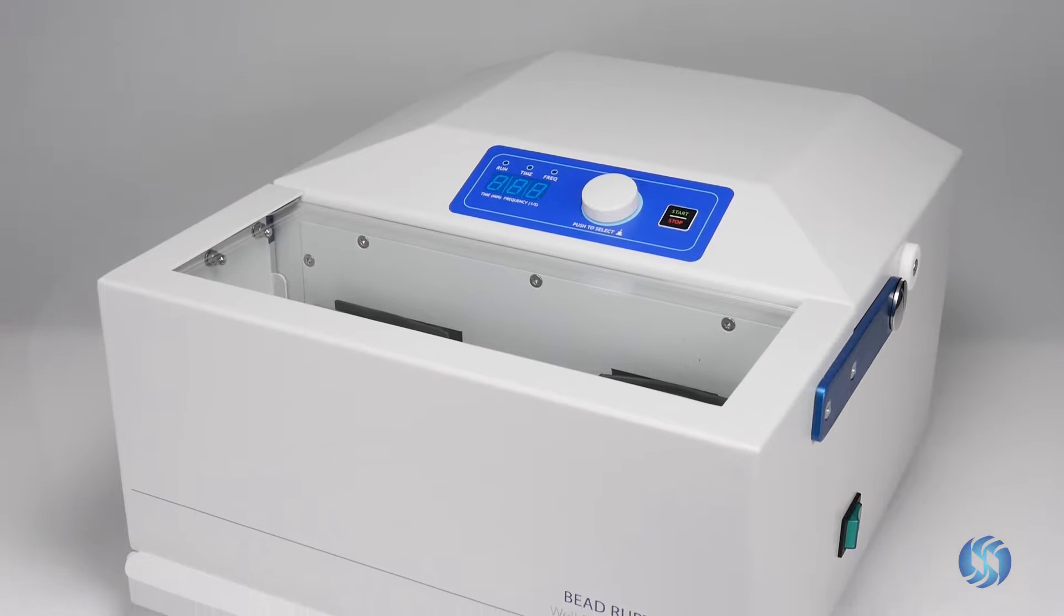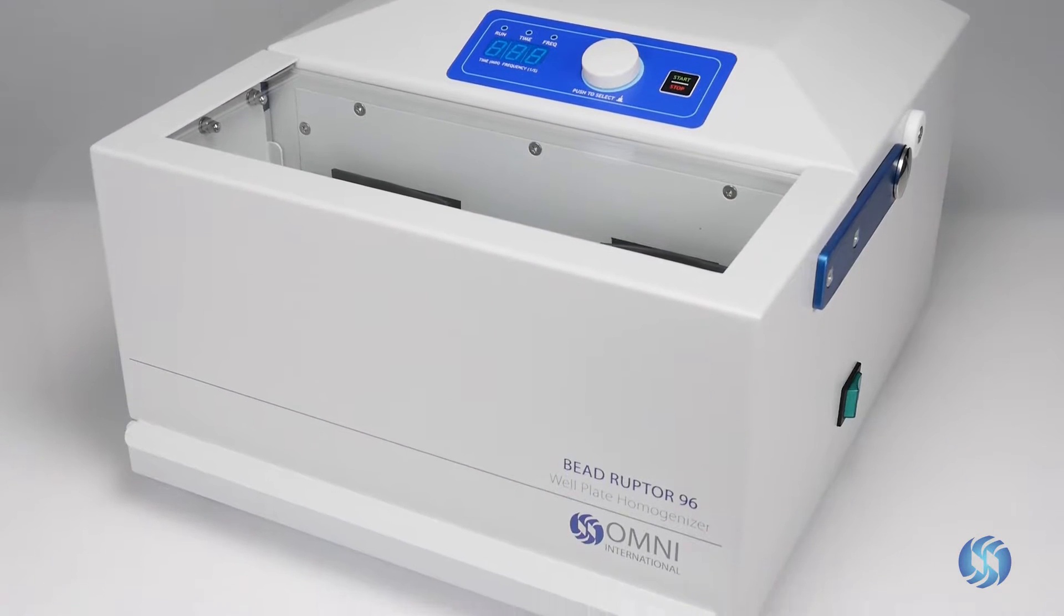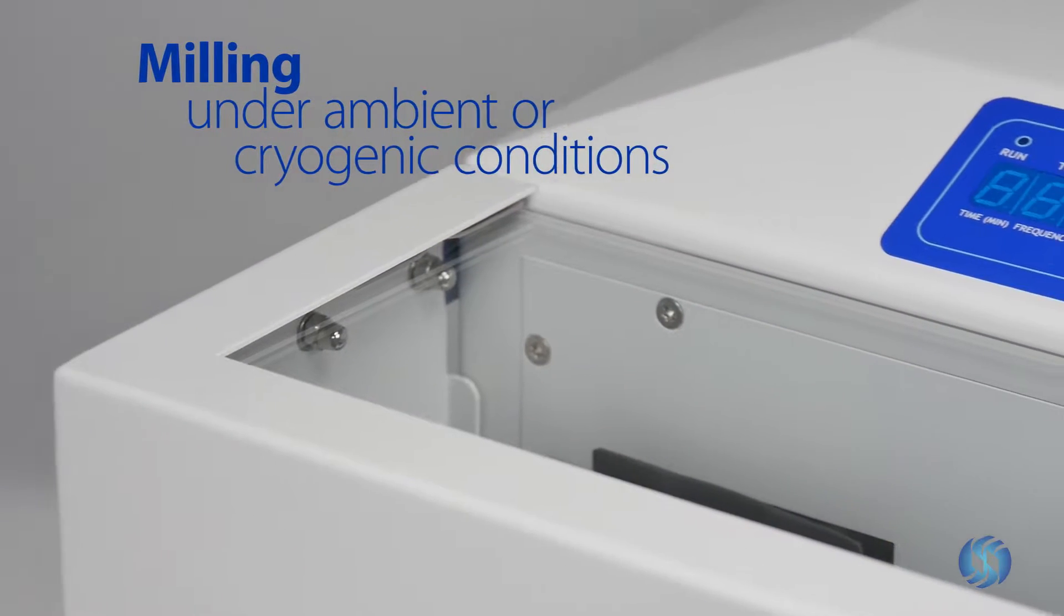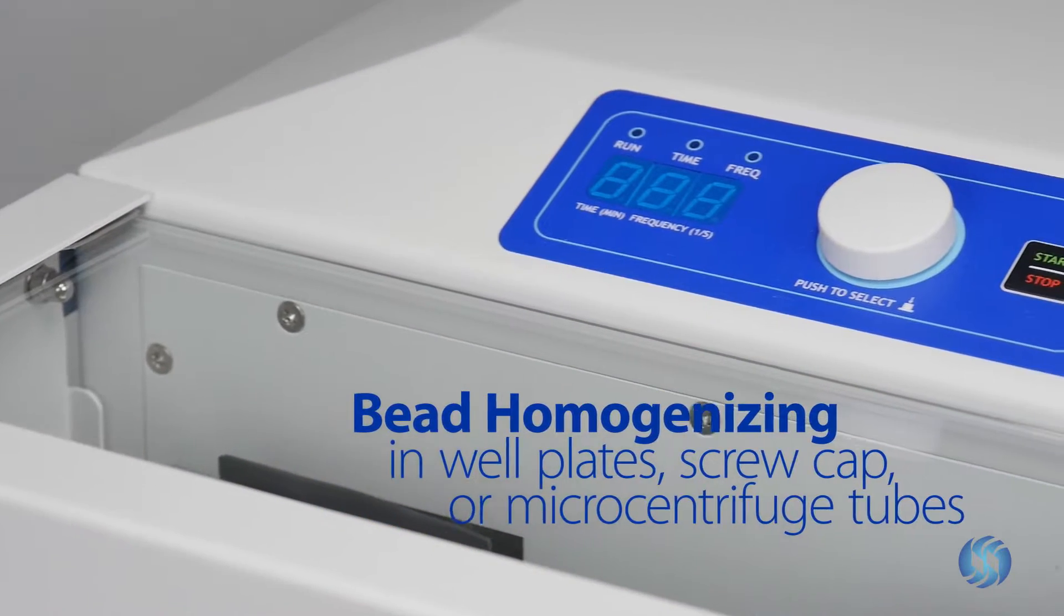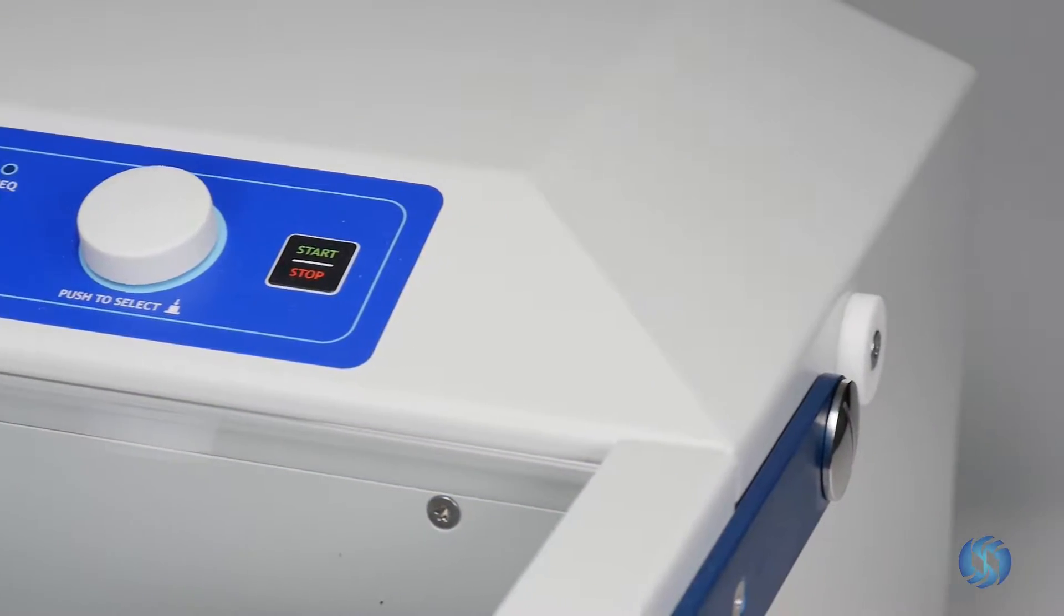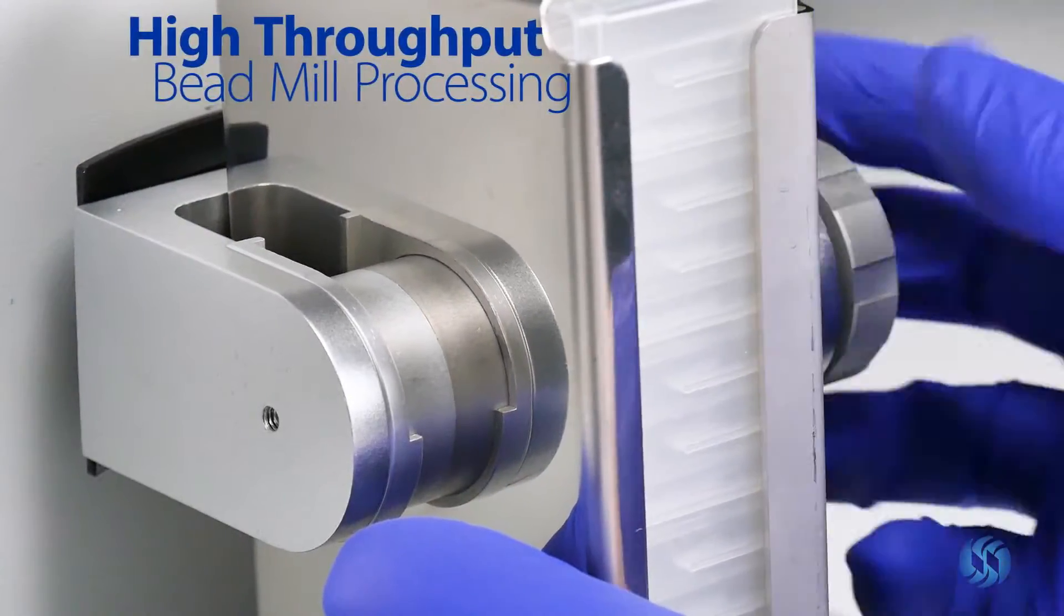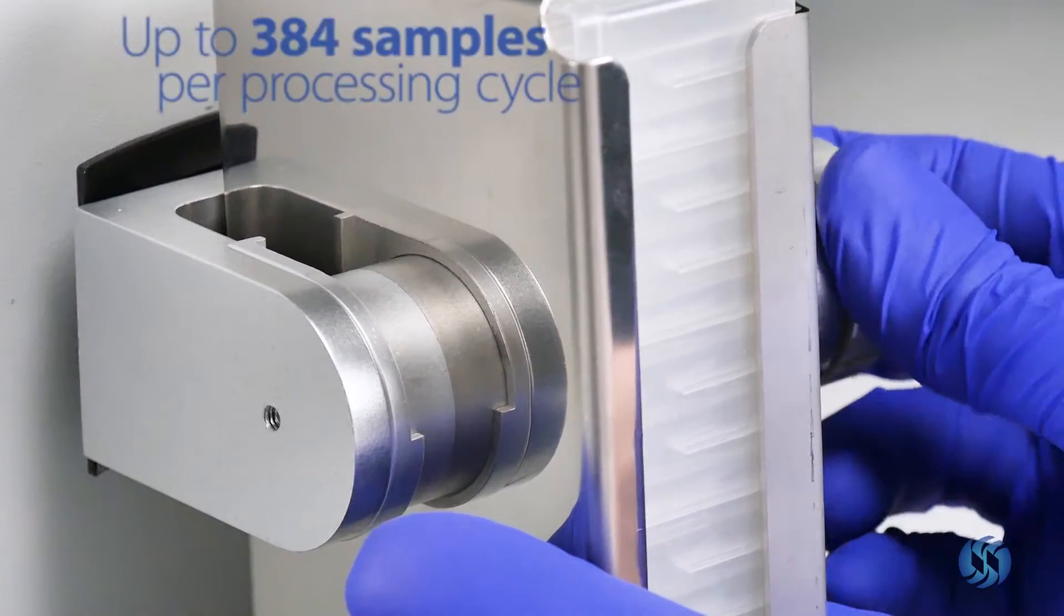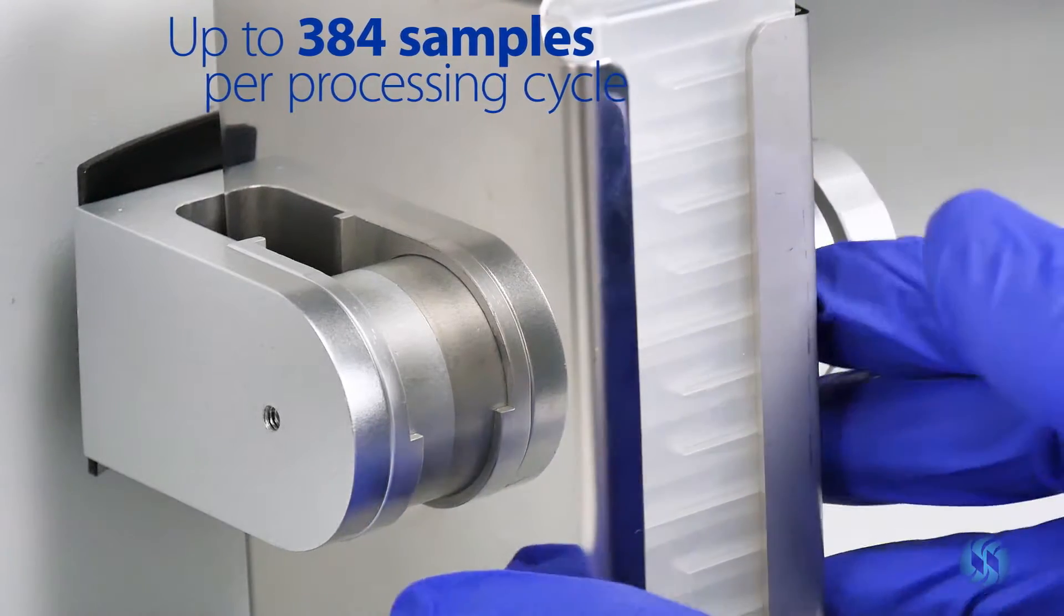The Beadruptor 96 is the most versatile homogenizer on the market. Designed for milling under ambient or cryogenic conditions or bead homogenizing in well plates, screw cap, or microcentrifuge tubes, the Beadruptor 96 is ideal for labs requiring high-throughput bead mill processing and is capable of dissociating up to 384 samples per processing cycle.